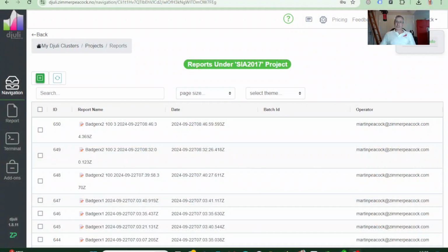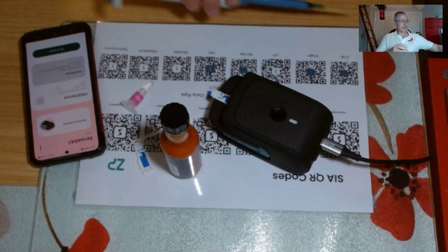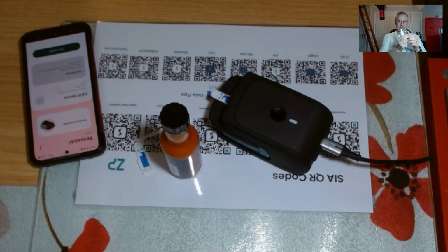So I'm just going to share this screen with you because every time we do a measurement on the Food Sense Generation 4, we actually end up always saving the data to the cloud, and that means we can do a comparison. So first of all, let me just kick off with the let's gather some new data kind of demonstration.